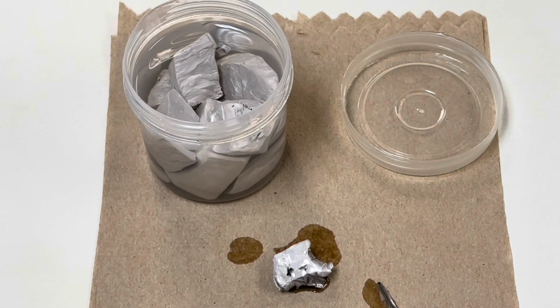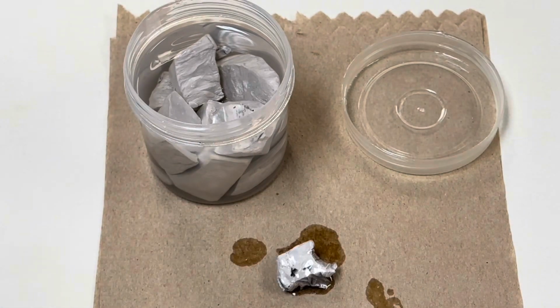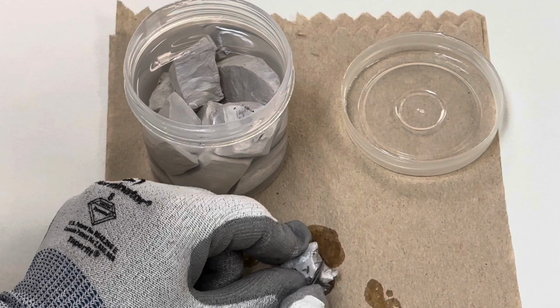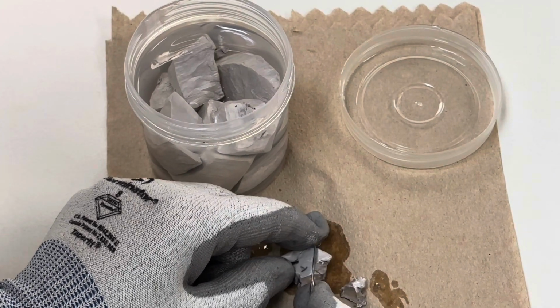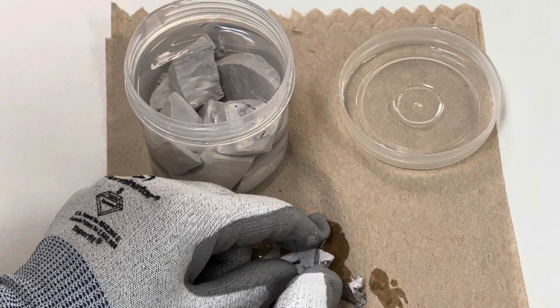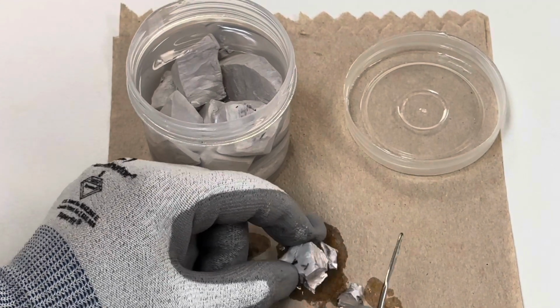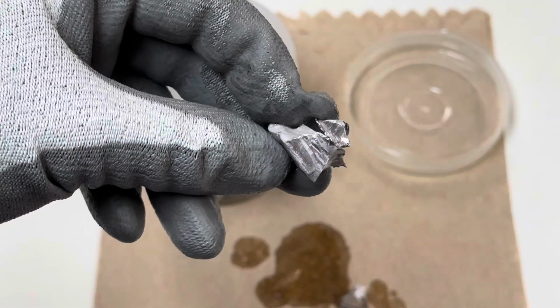Next, select a small piece of sodium from your mineral oil. Sodium is stored in mineral oil because it reacts with water. Use a spatula to cut a couple pieces that are small enough to fit down your test tube. You might notice that sodium has kind of a gray color to it, but that's really the oxide layer. Underneath that, it has a very bright, shiny luster.